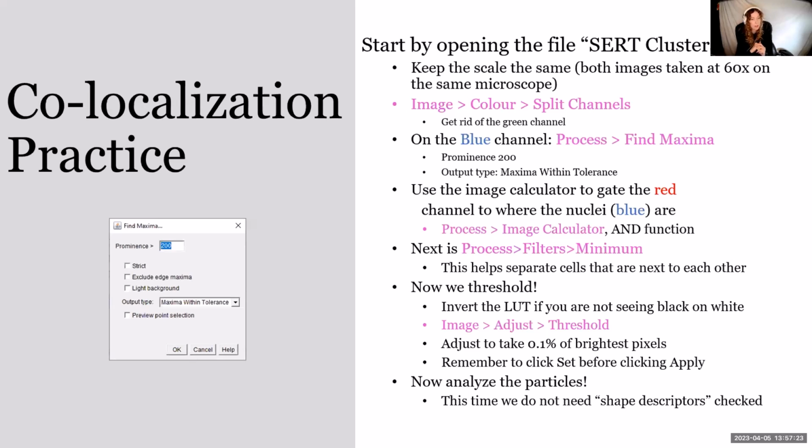I have not figured out how to increase the font size other than control plussing it until I can see things. And our resident expert has answered the question. Thank you so much.